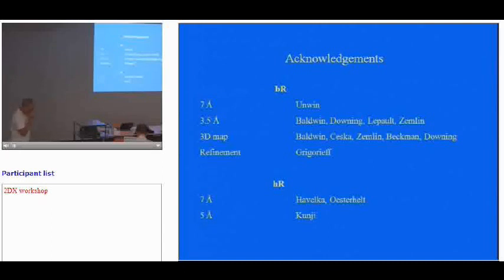You can flip the pattern, and the spots fall on top of the other spots, and then you get the average of them. In fact, in 1983 or so, Linda Amos and Jim Dethridge did some early negative staining of Sulfolobus cell wall. They used a similar approach, before unbending and so on. And they published a 3D structure in Nature, space group P622. Later on, Baumeister, whose earlier career consisted of 3D reconstructions of cell walls, came along. Jim Dethridge and Linda did this as a sort of side project, and there was some debate as to whether it ought to be published, but it was.